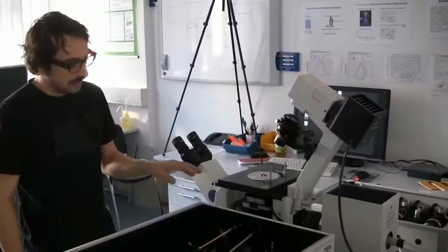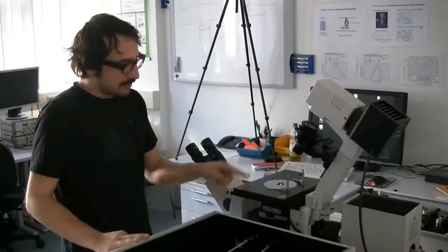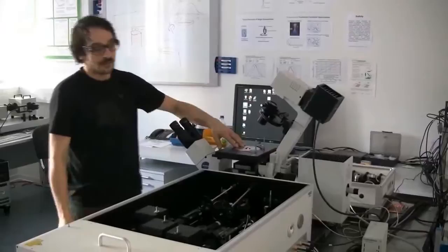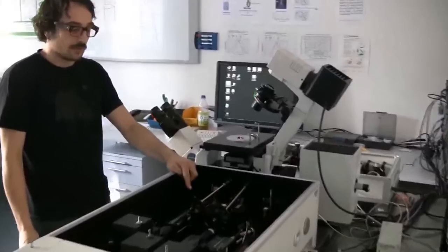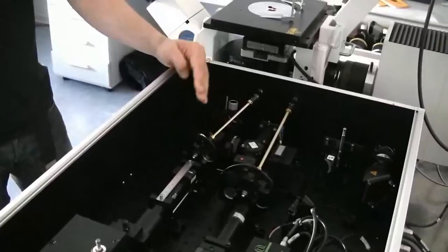The advantage of using this kind of setup is that you have the rear port of the microscope still fully available. For example, you can see a lamp connected to this microscope, and you can also use the normal position of the dichroic filter cube — so you keep the full functionality of the system available. You can still connect a camera and use it as a wide field microscope or as a TIRF microscope. Basically you just add the confocal option to the system. The microscope objective focuses the excitation beam into the sample, where fluorescence is excited, and the fluorescence is collected by the same objective going back the same way. The fluorescence passes the dichroic because fluorescence has longer wavelengths than the excitation beam, and the dichroic is manufactured to only reflect the laser light but not the fluorescence light. The fluorescence comes out as a parallel beam and is then focused by the tube lens onto the confocal pinhole.